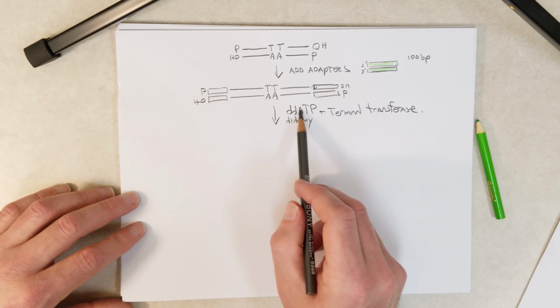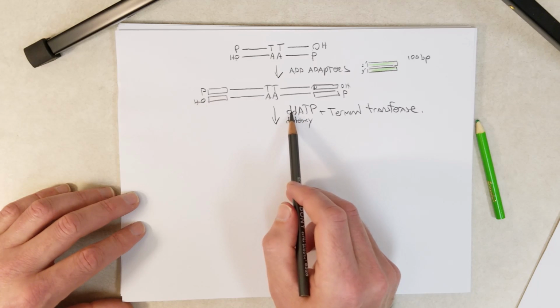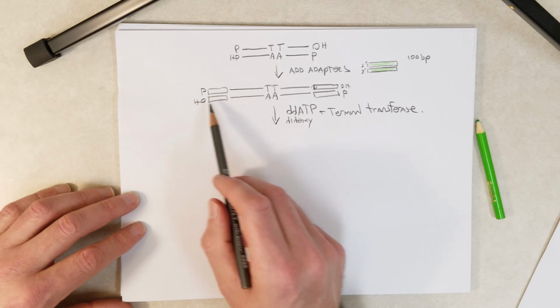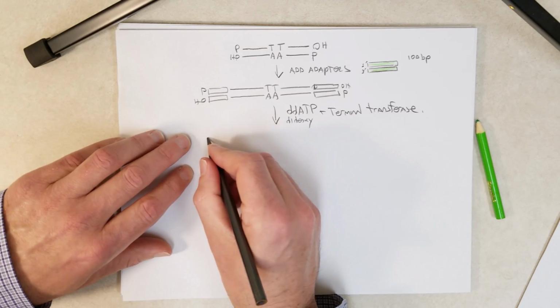So it's going to add one adenine nucleotide. But that adenine nucleotide is going to be lacking a 3' OH group. So we're essentially getting rid of these OH groups by adding an A nucleotide without a 3' OH. And that's going to be important.